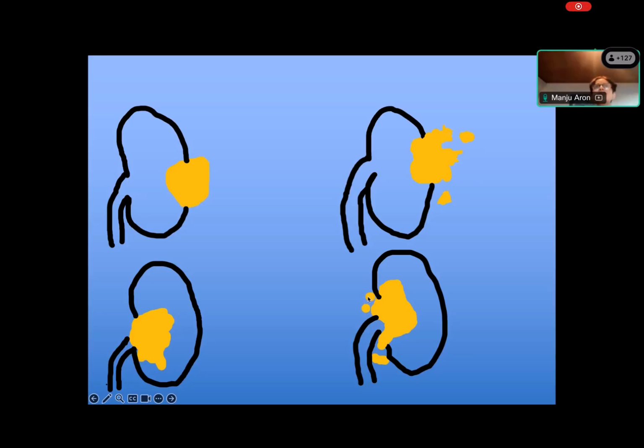When you see this kind of nodules, it almost invariably represents tumor present within tributaries of the renal vein. So that is very important to document. And if you take sections from there, you will see that this is all examples of spread of the tumor beyond the kidney. So these are all examples of pT3a tumors that have gone beyond the kidney.